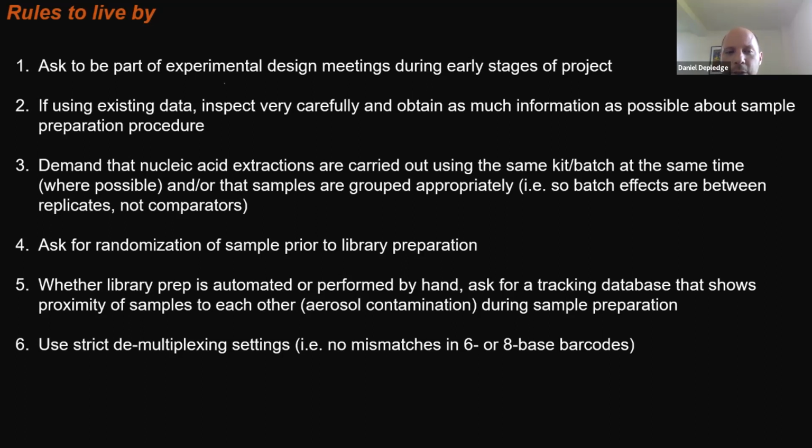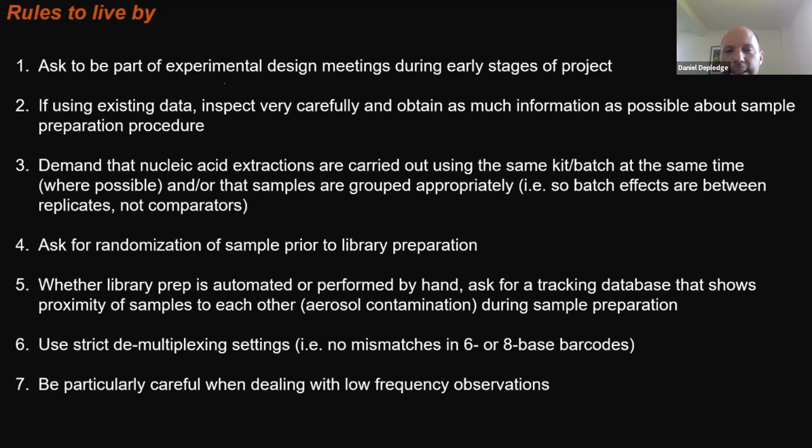You'll hear more about demultiplexing at a later date, but basically always be very strict in your demultiplexing to make sure you don't mix samples from different batches. And in general, just always be careful when you're dealing with low frequency observations.